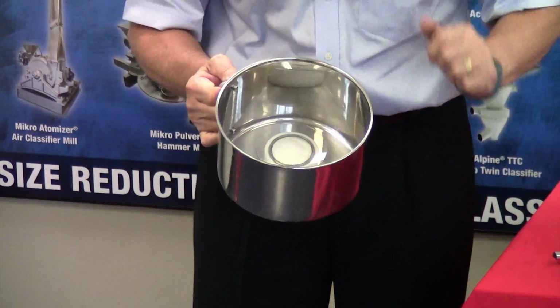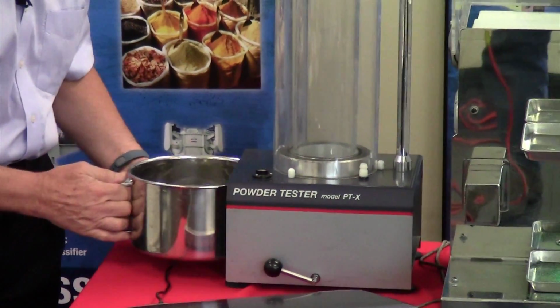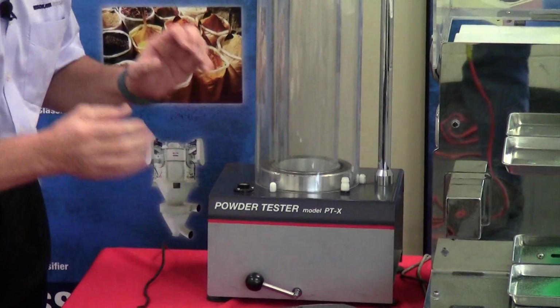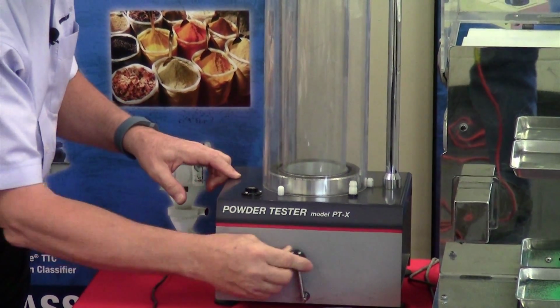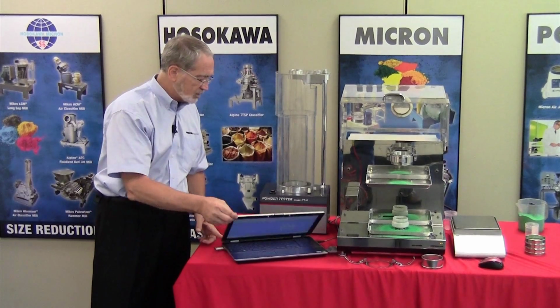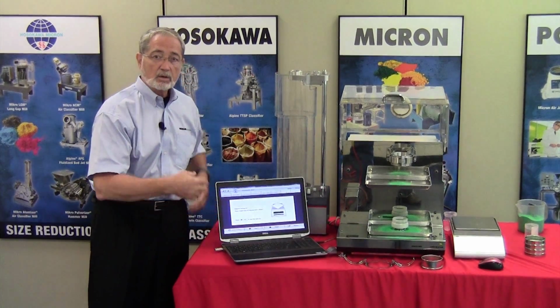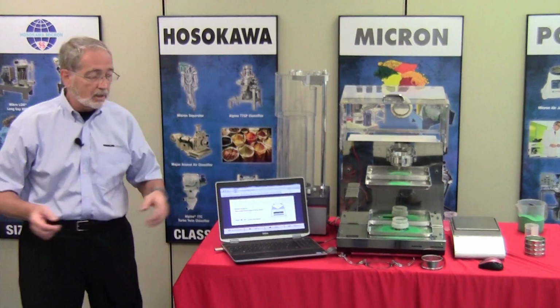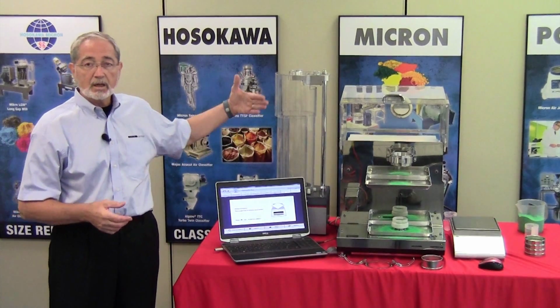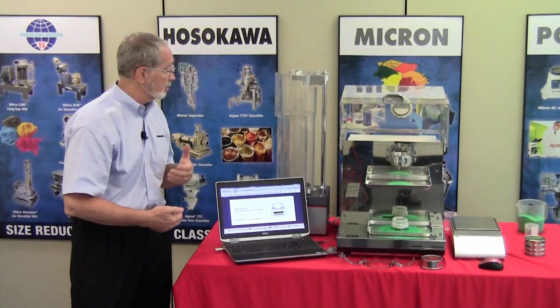The watch glass has a ring on it, and we set the watch glass in place. We then slide it into the cavity, which has a perfect alignment for it, and then we'll close the lever. Now, there'll most likely be a slide in here that will give us those kind of instructions, but in this case, again, like in the past, I like to place things in order so that we can just proceed through the test without any fear.